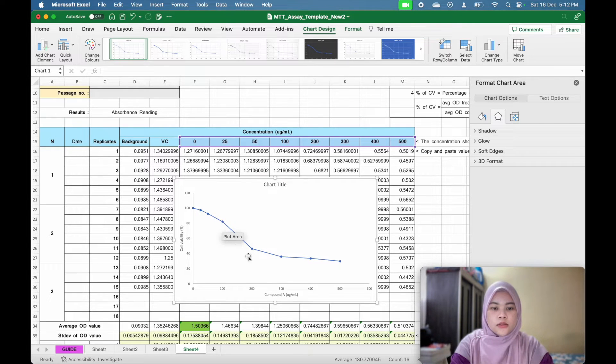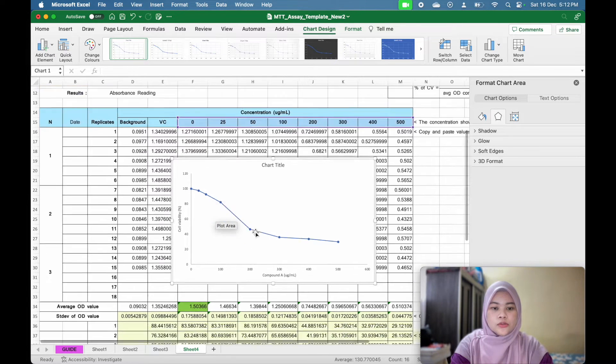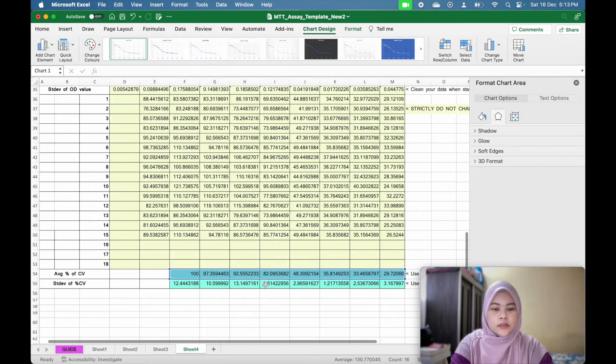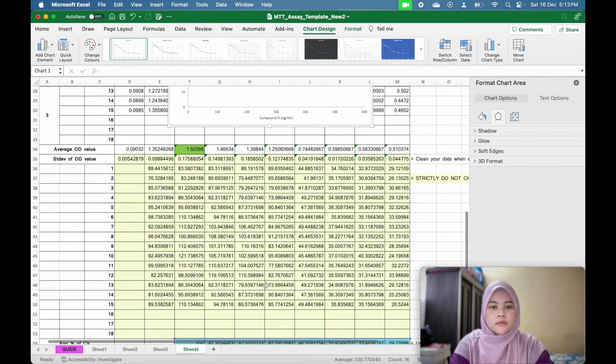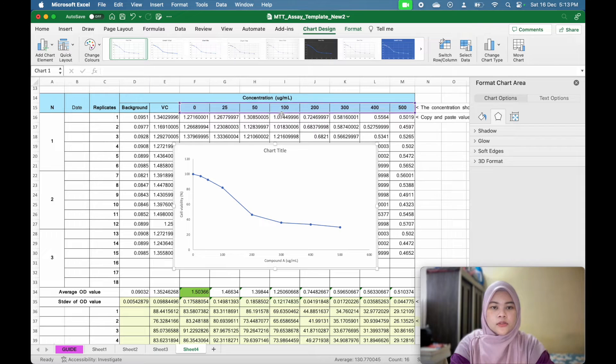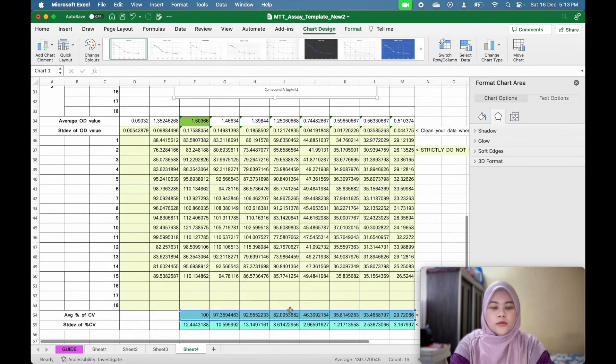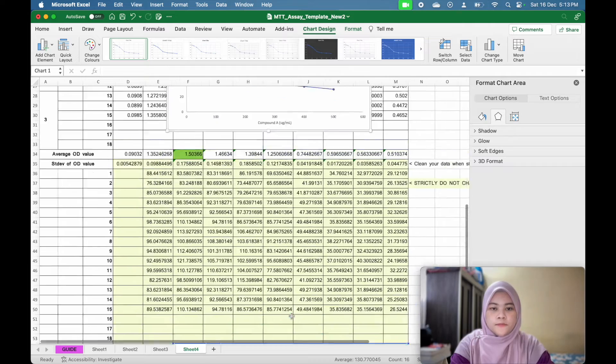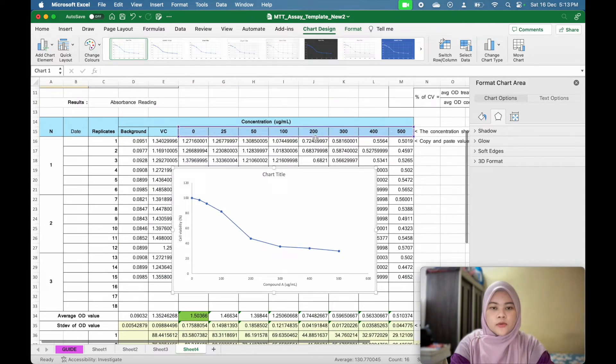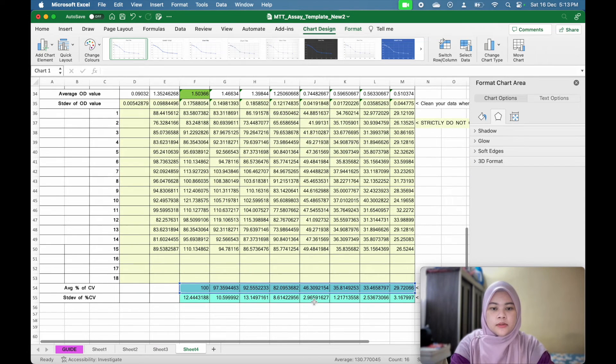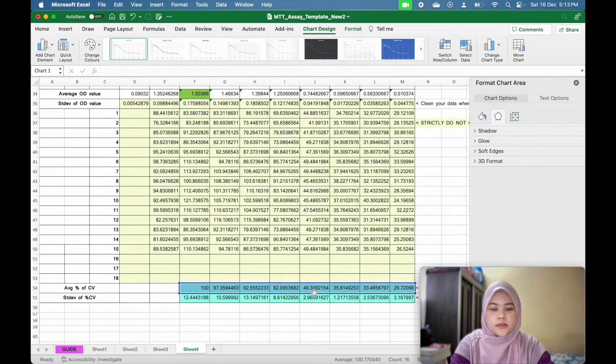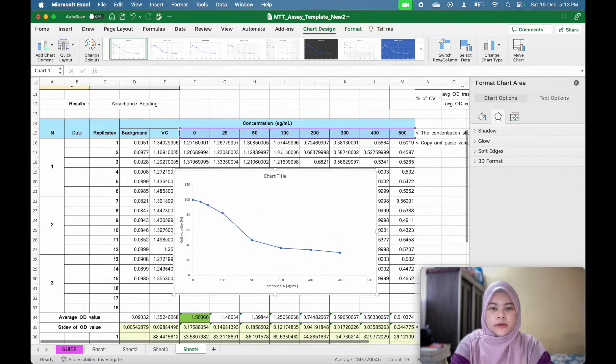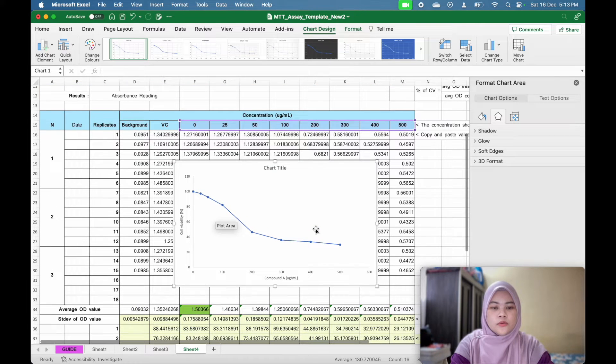So to get the equation here, you can go to add chart element. But before that, you need to see the results. For example, at 100 concentration, your cell viability is 82%. And at 200 concentration, 200 microgram per mL, your cell viability is 46%. So your 50% is between this one. Your 50% viability will be between 100 to 200 microgram per mL.